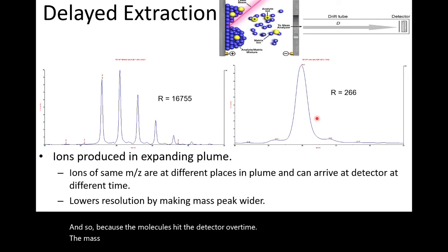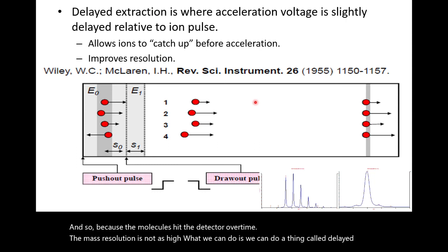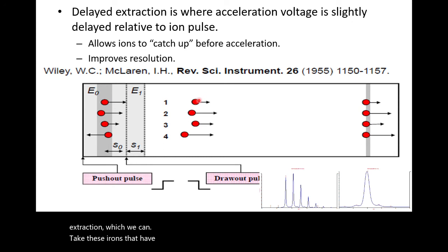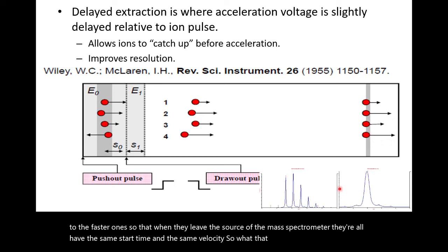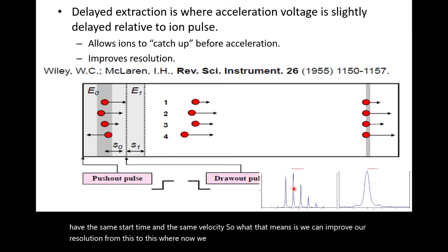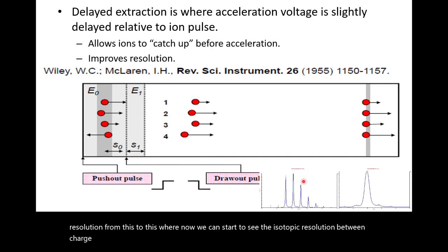What we can do is a thing called delayed extraction, where we take these ions that have different flight times and allow the slower ones to catch up to the faster ones, so that when they leave the source of the mass spectrometer, they all have the same start time and the same velocity. So what that means is we can improve our resolution from this to this, where now we can start to see the isotopic resolution between charge states of, in this case, a peptide.